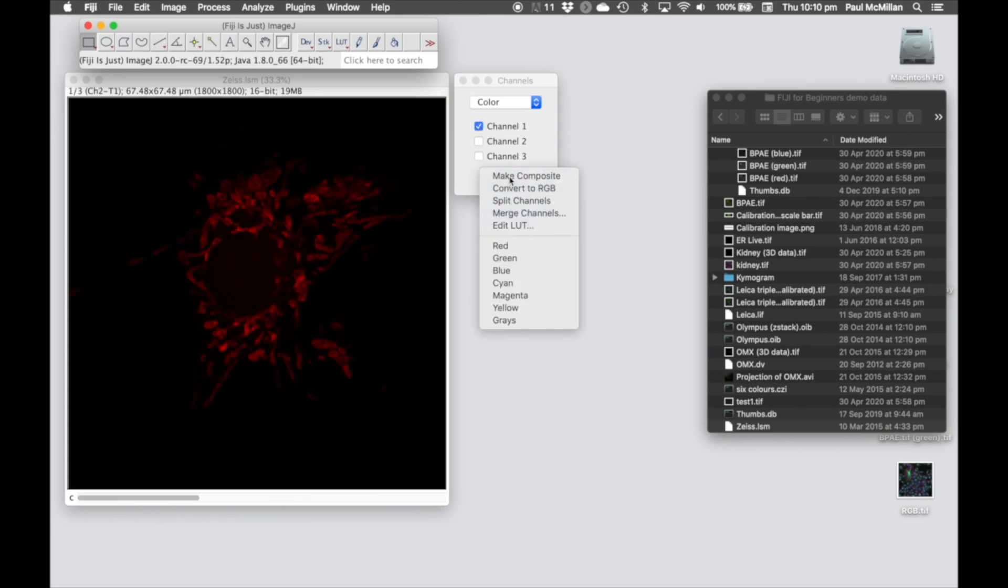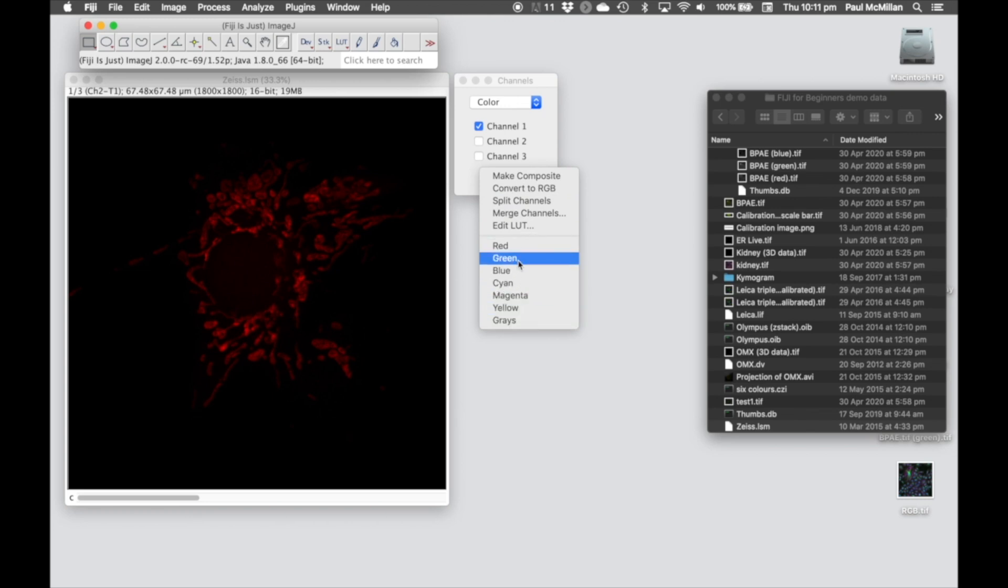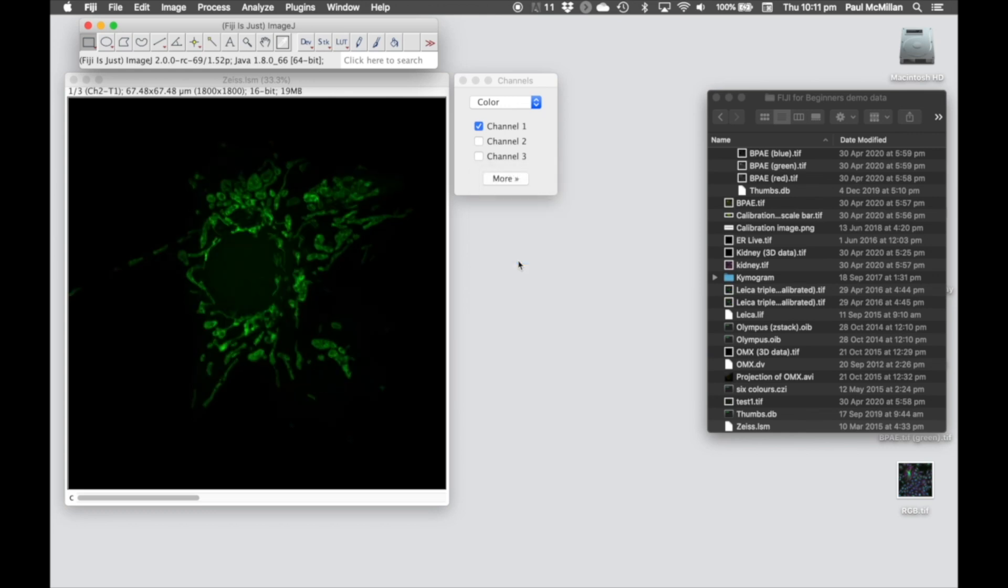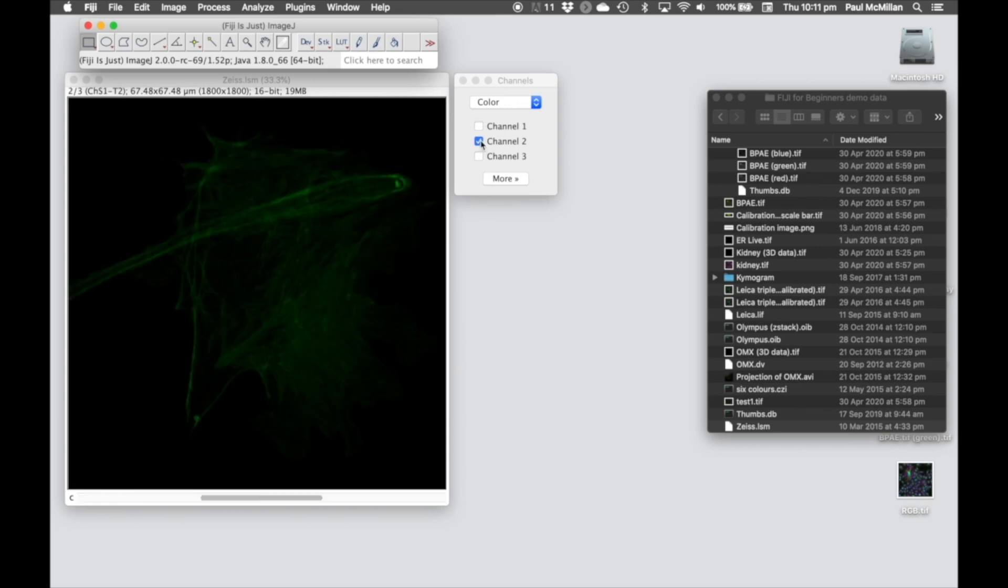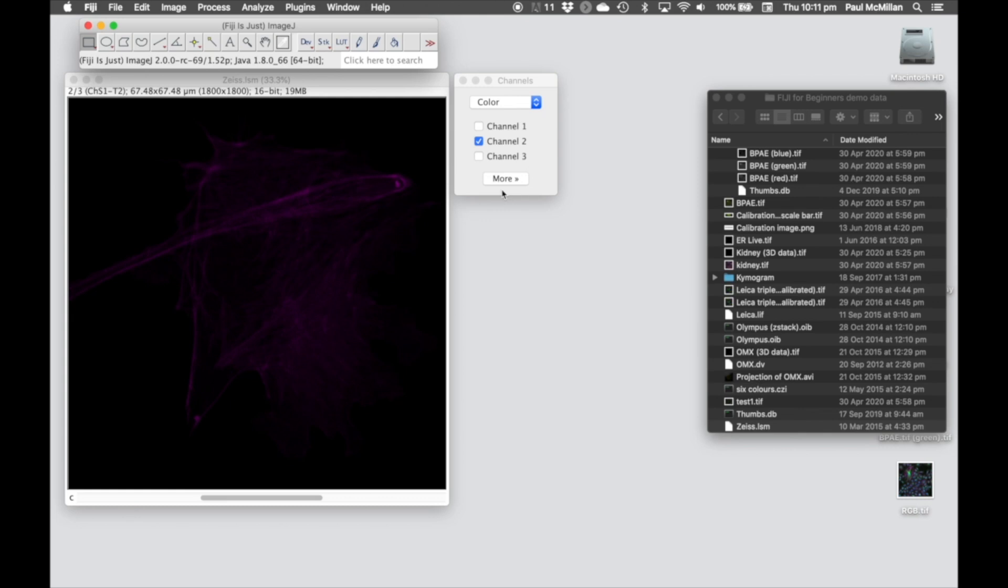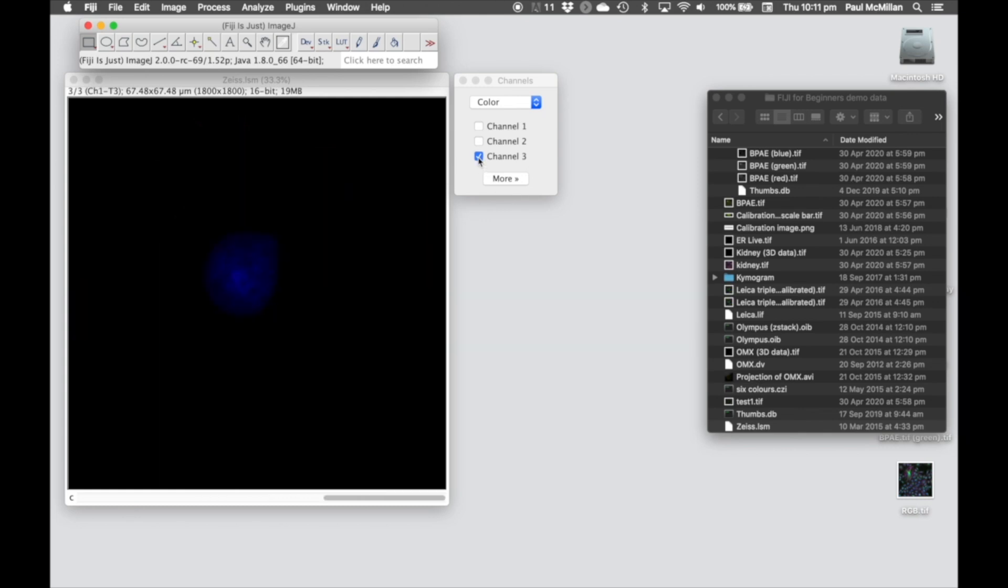If we go to More, we can actually change what the lookup table is. So let's change, for example, the red channel into green. And then let's maybe make this magenta. And then we'll keep the nuclei in blue.